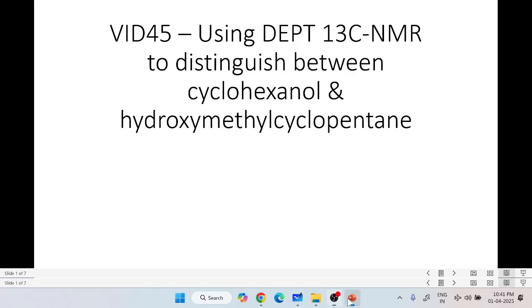Hello students, in this video we are going to use the DEPT-13C NMR technique to distinguish between cyclohexanol and hydroxymethylcyclopentane, which are two constitutional isomers, with the same molecular formula. Both are alcohols with different structures.